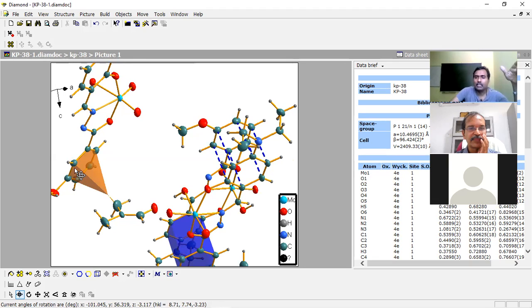So likewise, if you have metal pi interactions with the metal and the oxygens, or the oxygen and the pi ring interaction, whatever it is in the table, you can find out and decide whether it is significant. And after that, you can draw in a similar way. There is no special way. Only this polyhedron is the way to use this kind of interactions, and different symmetric molecules will be connected together by means of all these different interactions.